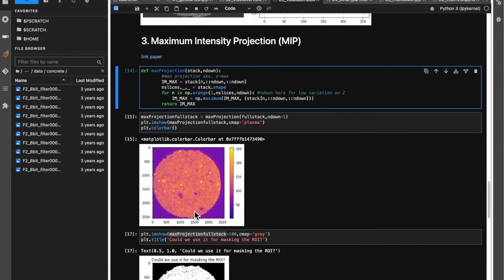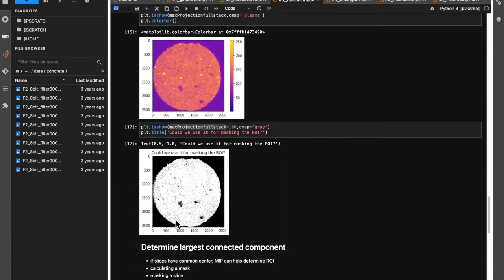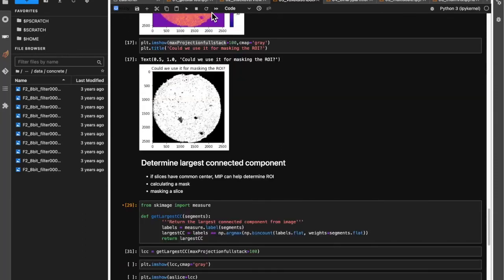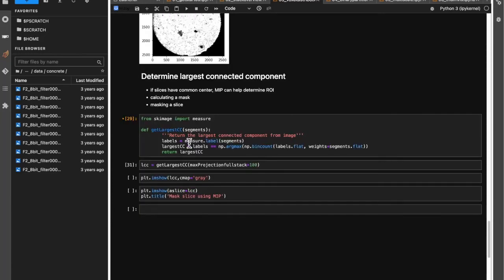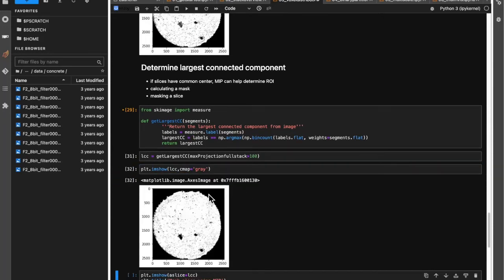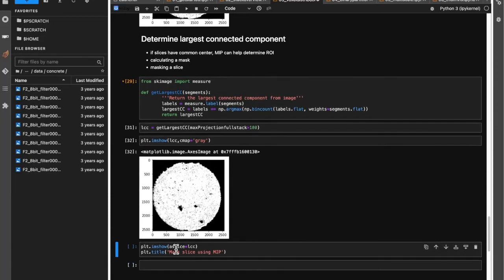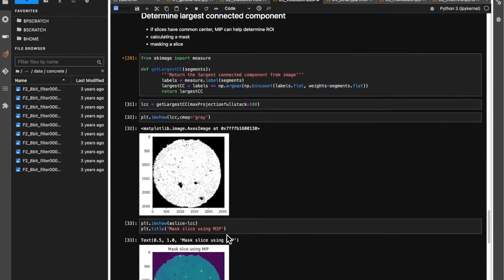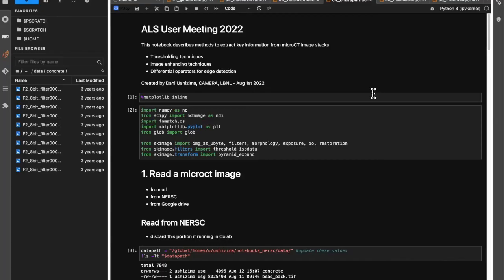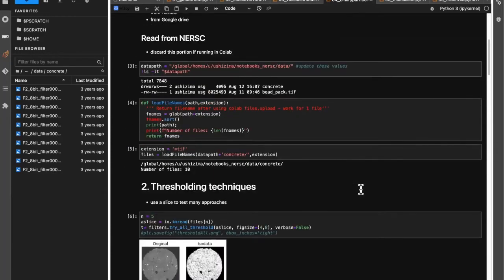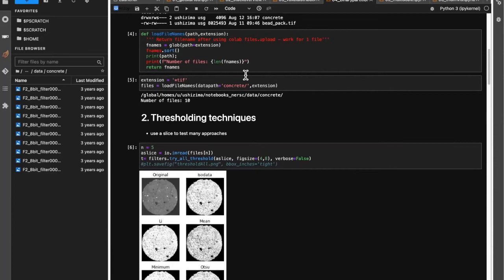I'm starting with the first slice and then keep comparing, getting the maximum over and over again. I put it here with a color bar to show the variation of intensity values in the maximum intensity projection. You can use a maximum intensity projection as your mask, so you can quickly determine what's inside and outside of your sample. I could use this as my region of interest. Sometimes there are a few speckles here and there — one way to handle that is to calculate the largest connected component. That's the result: there are no more speckles. And you can use that as a mask. Lesson four — let's go directly to the threshold. I load my stack and select one slice.